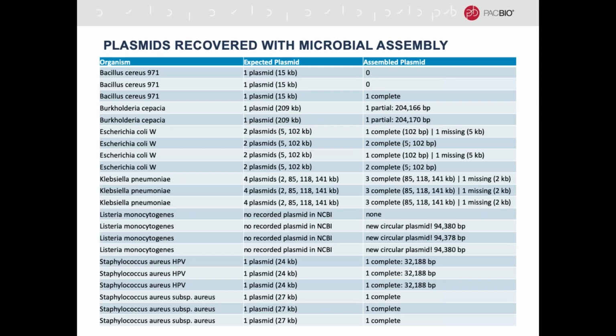What about plasmids? One feature that I'll explain in more detail soon is the plasmid assembly step. But essentially, in this pipeline we'll assemble chromosomal contigs, and then also we'll assemble the plasmids separately, so you can recover those as well. You can see that of all the strains where we're expecting plasmids, the majority are recovered as complete plasmids.